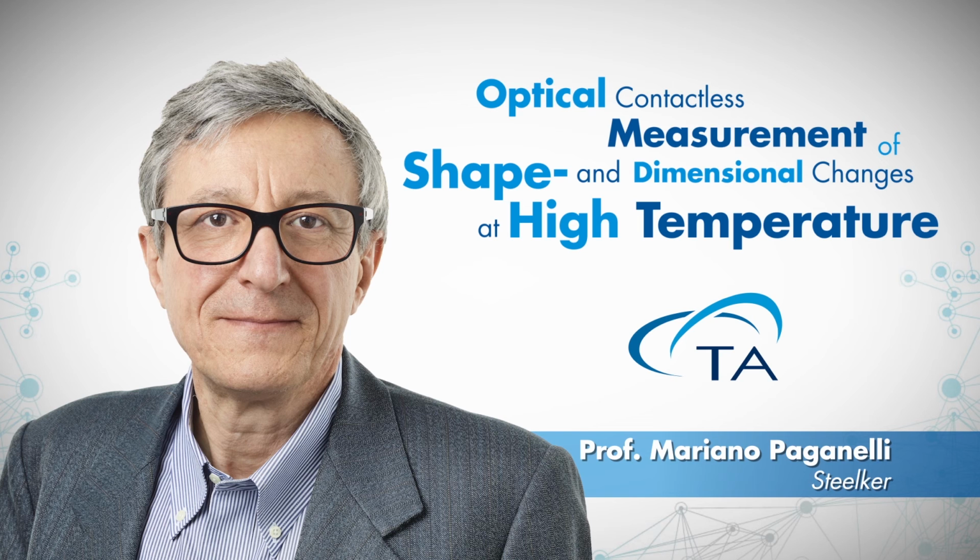Well, for us it's not a problem because TA has the widest range of dilatometers of all, optical and mechanical. But there are some considerations that can be made. I personally am the first to advise the use of a good mechanical dilatometer with silica measuring system if the goal is to measure the thermal expansion up to a moderate temperature, or below 1000 degrees, on a material which is always rigid. The silica dilatometer is still the best choice.